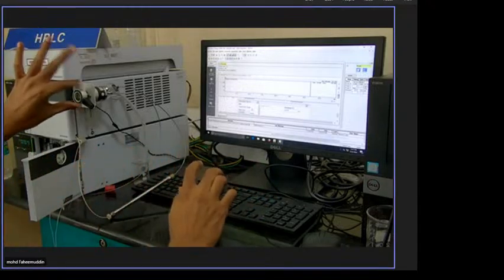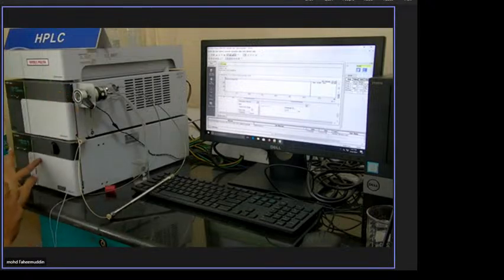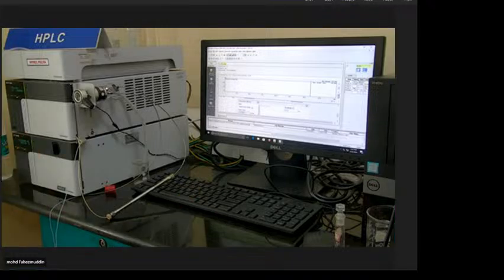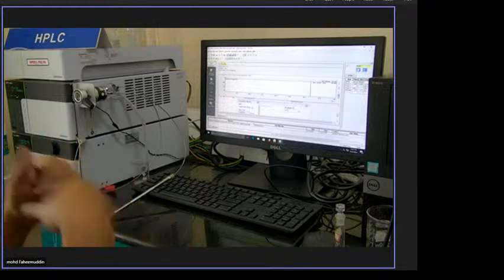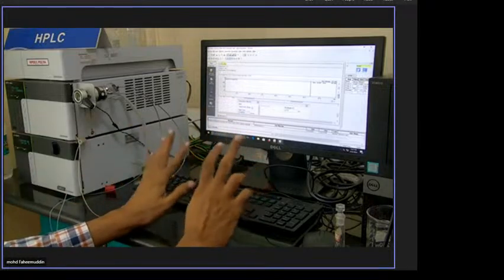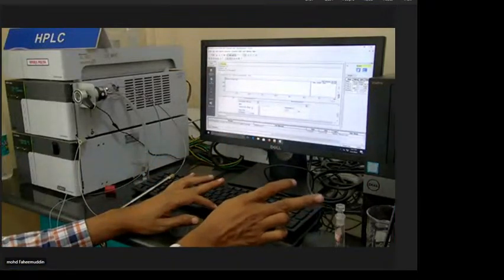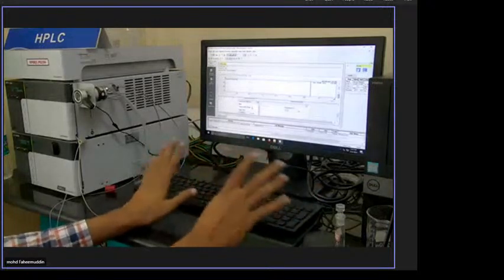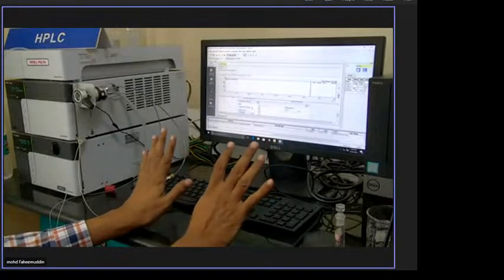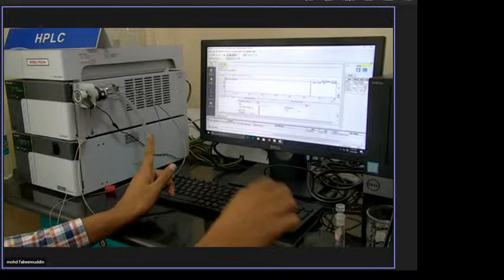So that is the injector. This is called a manual injector. Even in industry there are auto injectors. If there is a tray, keep the sample in the tray and close it. Then, overnight, until completion, we will get the spectra, and the spectra will be recorded and saved in a folder with the file name. After that, you can access it and check the results you want. That's called an auto injector. This is the manual injector.